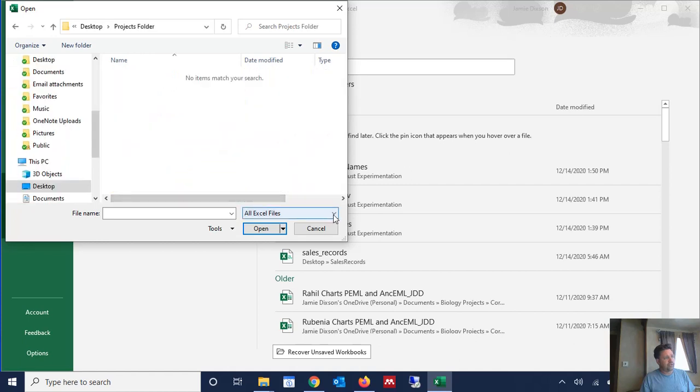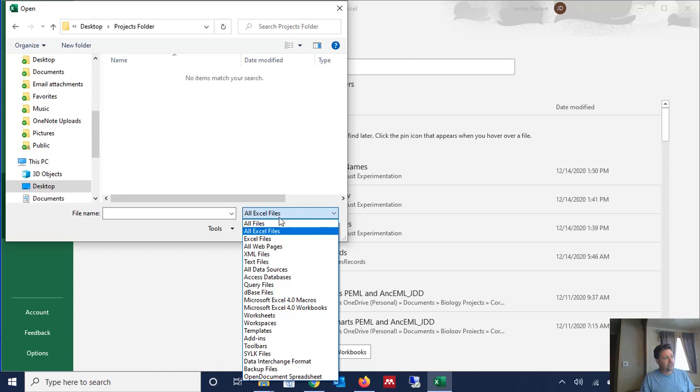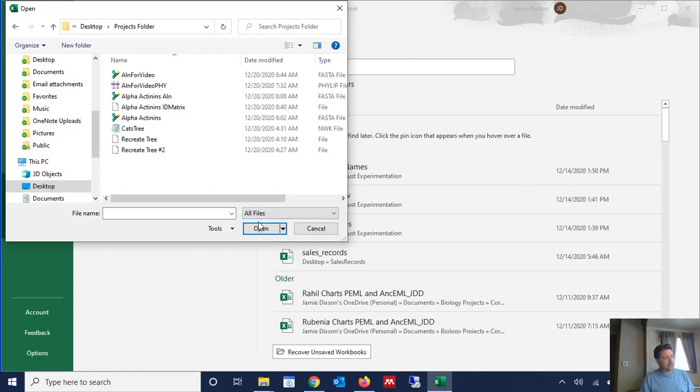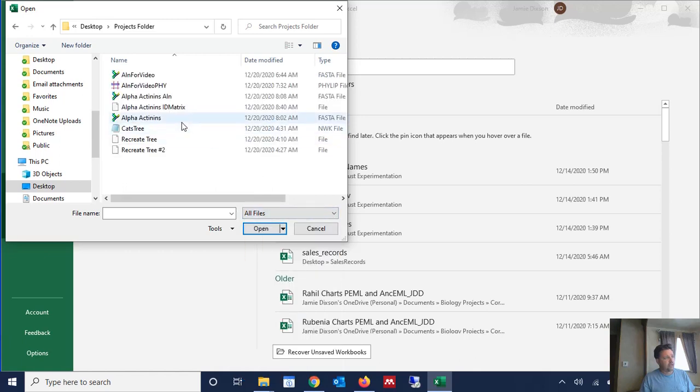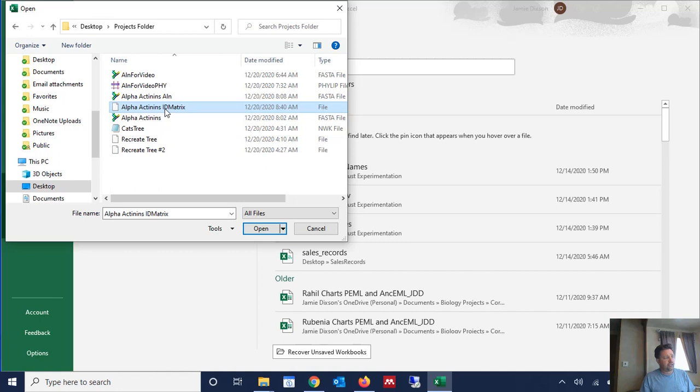And we're going to have to change the filter here to all files and then we see here is our identity matrix. Now BioEdit does not add a .csv extension to the end of the file. So it's just shown as a file here. So that's why we had to change the filter to all files. And we're going to open it.